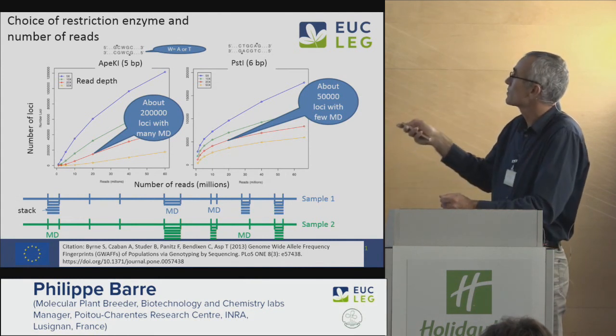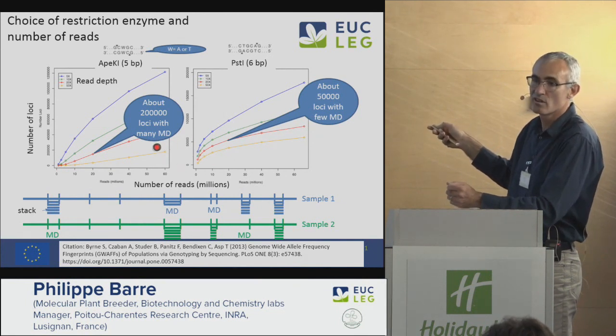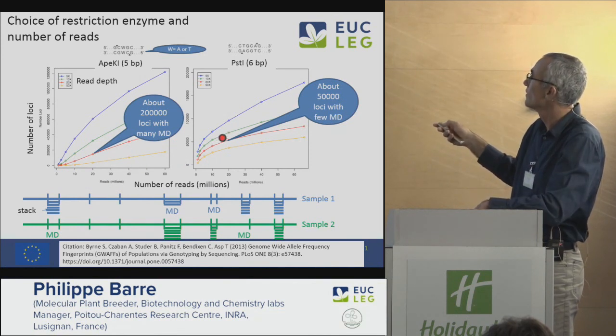If I compare that to PstI, you see the curve here reaches a kind of plateau. The slope decreases slowly.